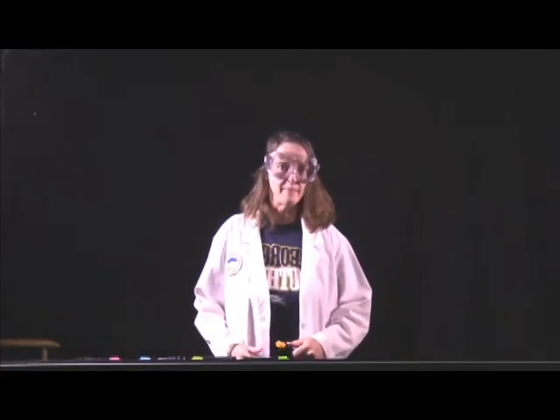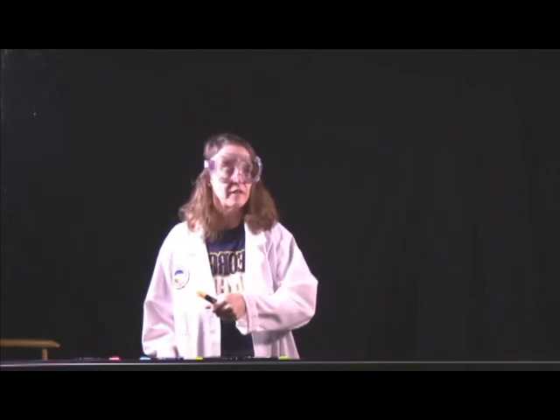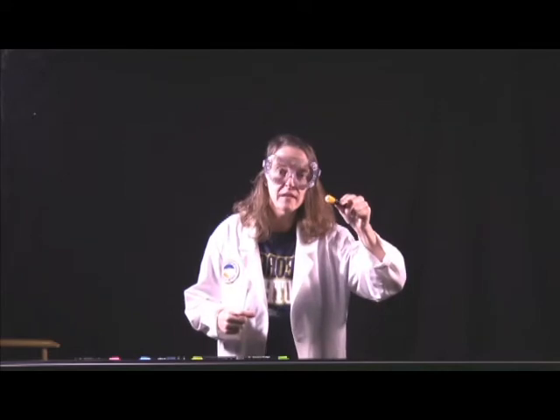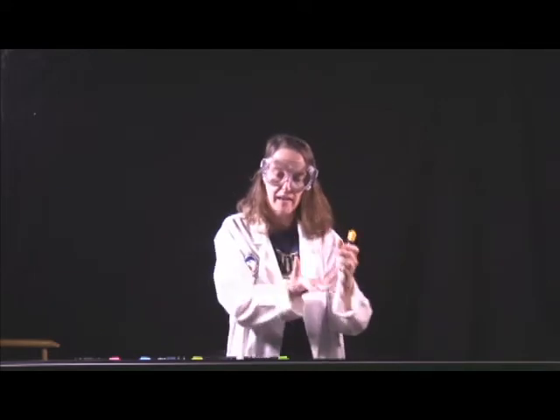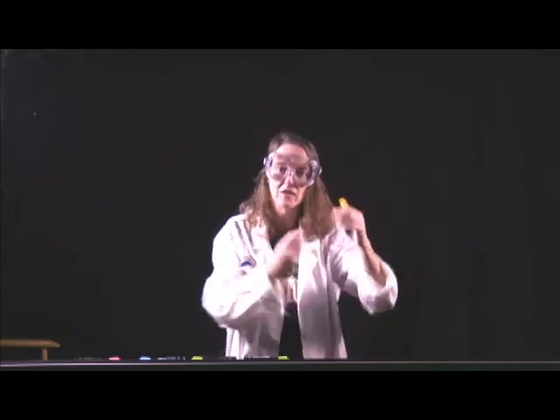Welcome to Chemistry Lab. Today's lab, titration of a strong acid and a strong base. You've done titration before. Earlier in the semester you did a potassium permanganate titration. Remember the purple stuff? We're doing the same thing again, but today we're going to put a strong base in the burette and an acid in the beaker below, and we will titrate one into the other.